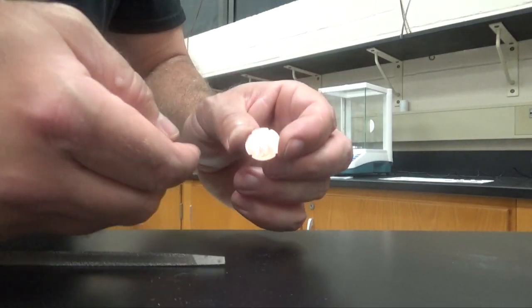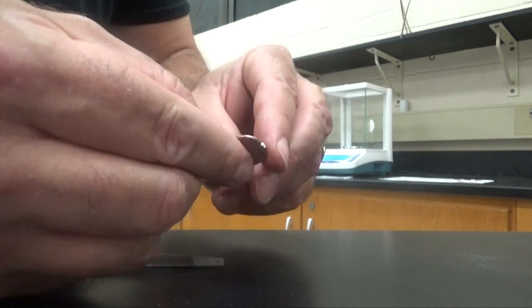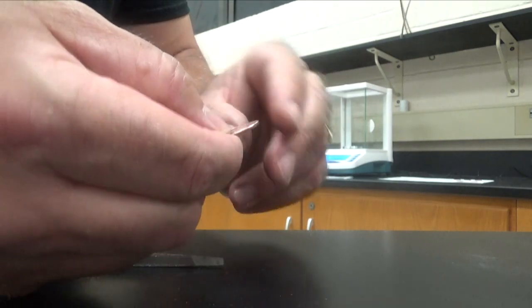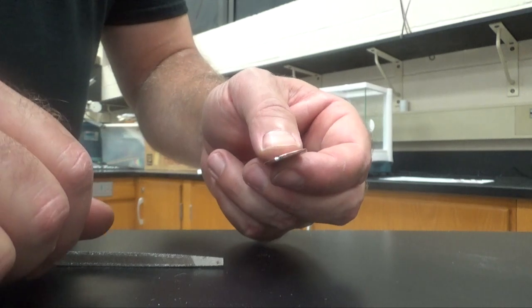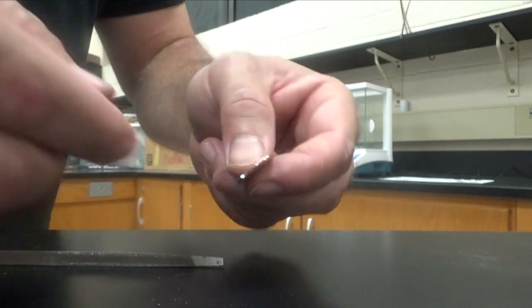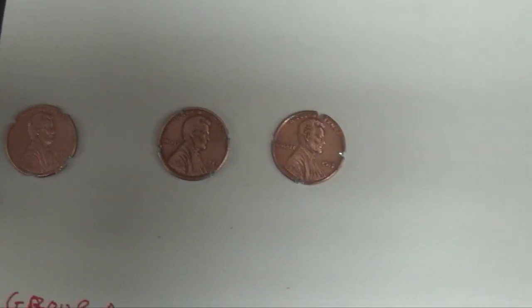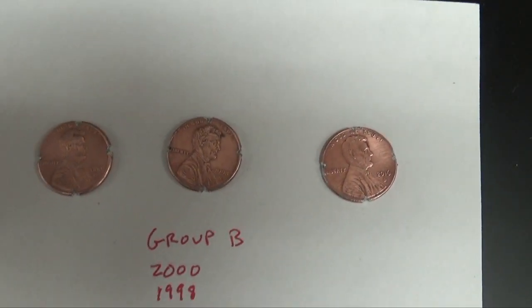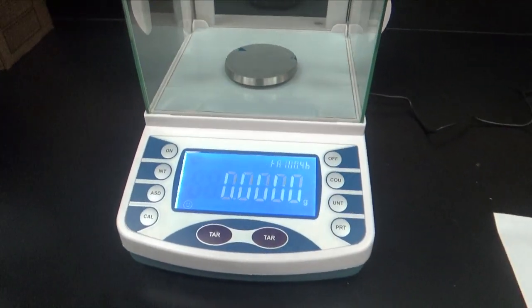As you can see, I've made several notches in the penny, and that is to allow multiple areas for the hydrochloric acid to get to the zinc that's under the copper, and also to allow for the gas, the bubbles, to escape, and hopefully the reaction can go to completion. Now that each of the pennies is notched, I'm going to weigh them on an analytical balance.